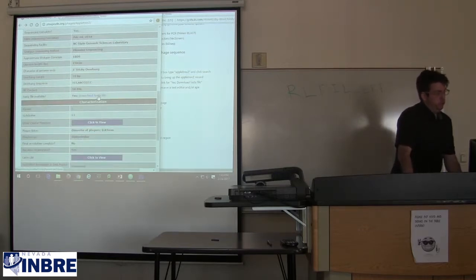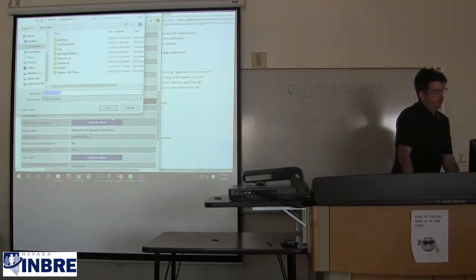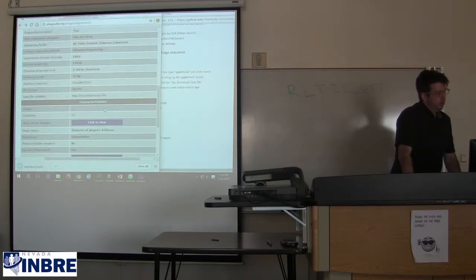And we're just going to start with the complete 73.8 KB genome, and we will right-click Save Link As on the FASTA file. Save it wherever you like, because we're going to be opening it a few times. I guess Documents is fine for me. I also threw it up in the GitHub repository. You could download it that way if you still had the main page open.